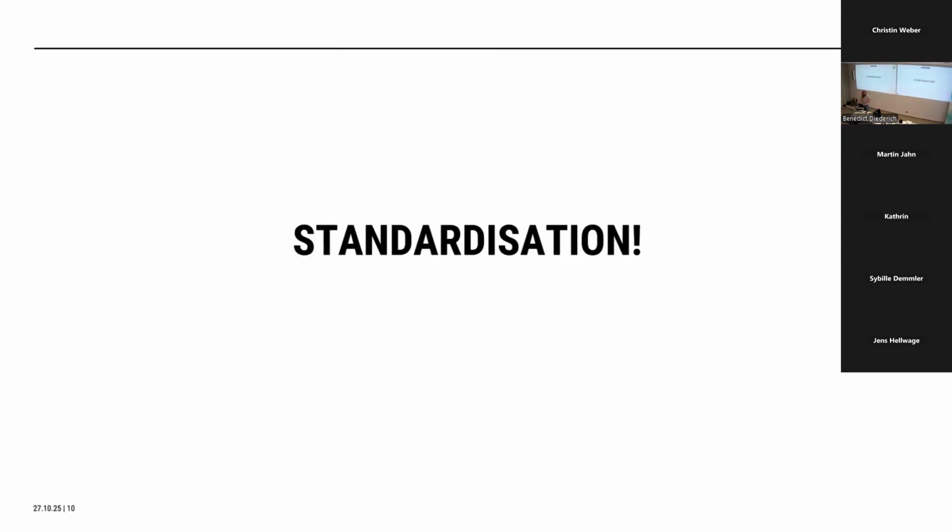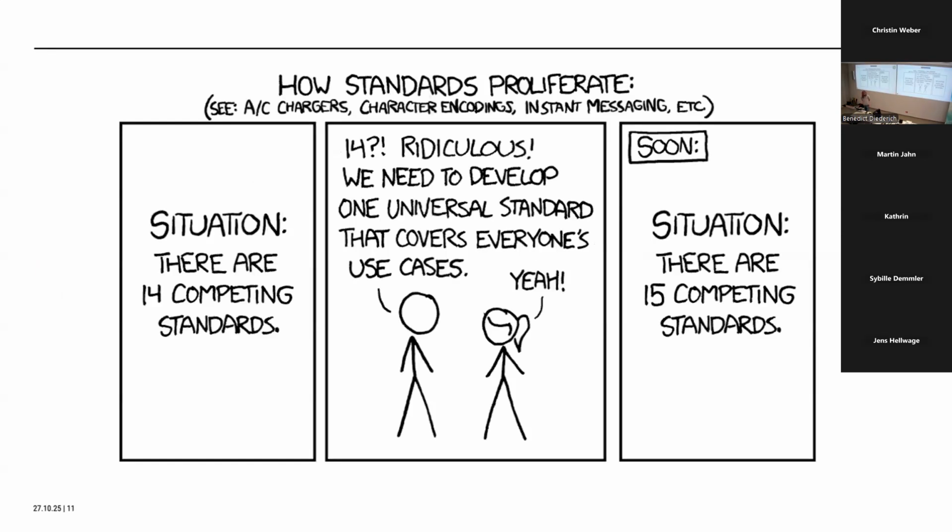And then the last bit is, why should we care about standardization? There's yet another comic that I like a lot, where you have all these different standards, and then one person comes along, oh, I want to unify everything, and they come up with the 15th standard. And that's not what we try to do. We try to implement existing standards and use those. For example, with an objective lens, that's the perfect example, there is the Royal Microscopical Society standard. So we don't create a new thread or something. We just implement that and make everything compatible with each other.